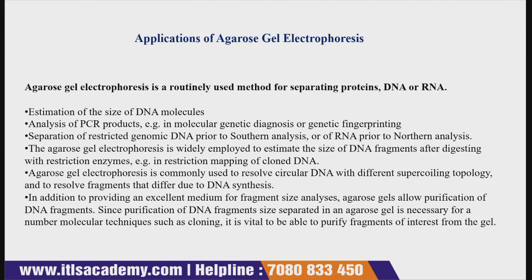Agarose gel electrophoresis is also widely employed to estimate the size of DNA fragments after digesting with a restriction enzyme, that is, restriction mapping of cloned DNA.